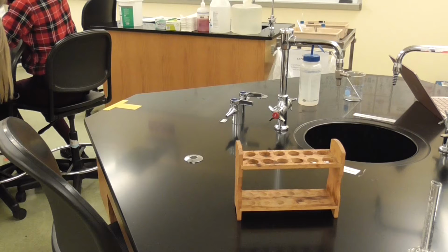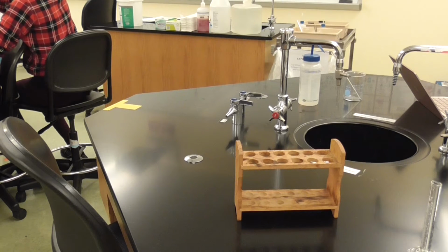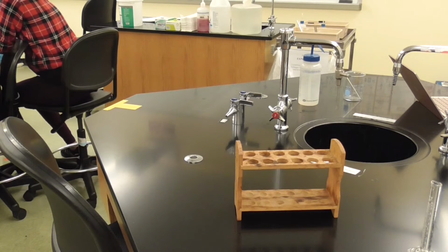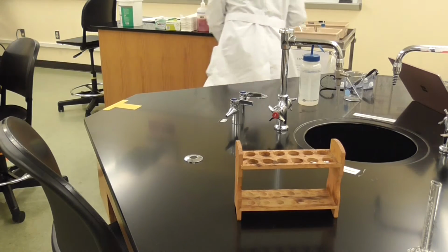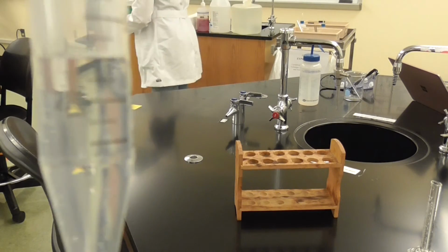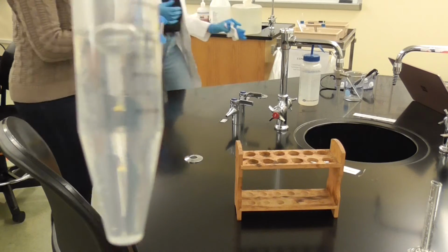After that, you are going to add methylene chloride, 2 milliliters, 3 times, to rinse it. Then we're going to see the extraction of the caffeine into the methylene chloride layer from the water layer. This is what it should look like now. We dissolved all of the caffeine. Should be kind of clear.